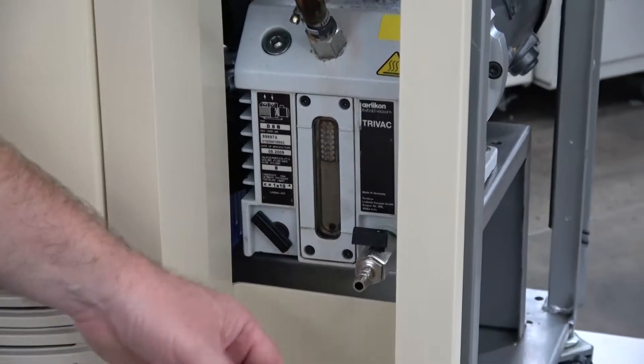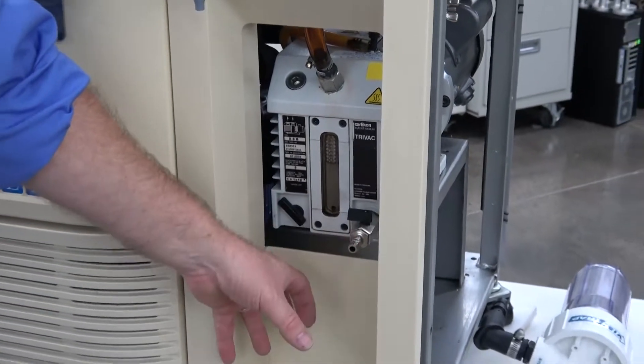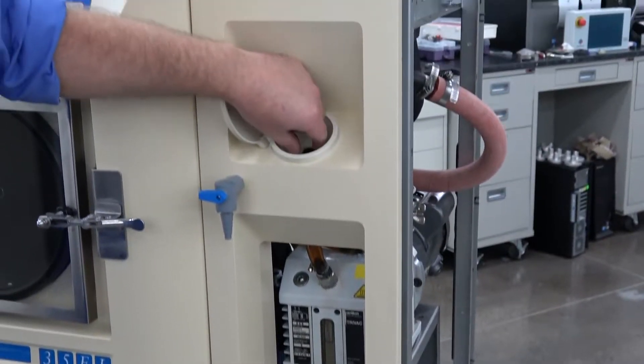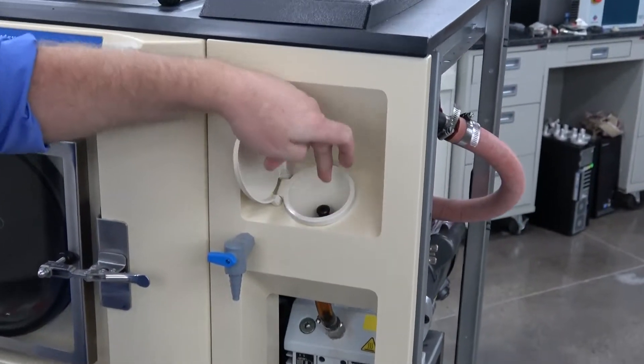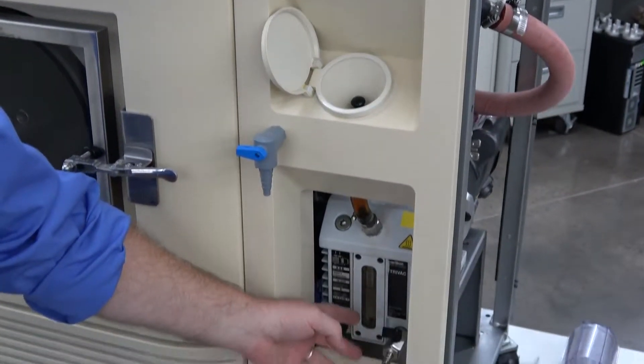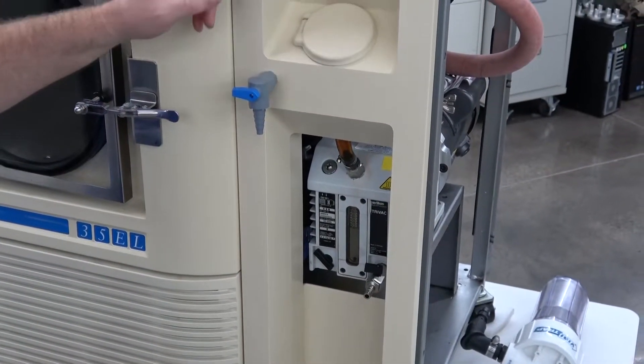So you can just pop a jug down here, put a hose, and drain it, and get it cleaned out. And then come up here and you can just pull this plug and refill the oil right back into your vacuum pump. A really quick way to do it — makes it nice and convenient.